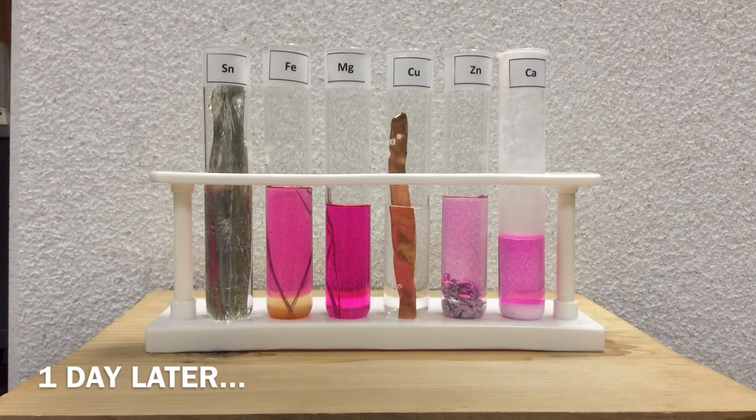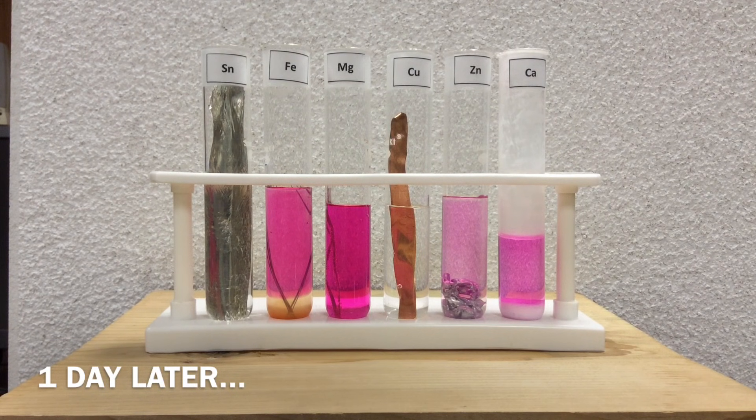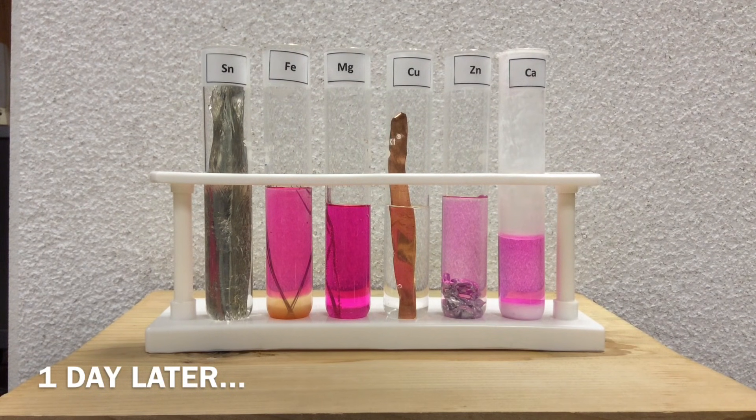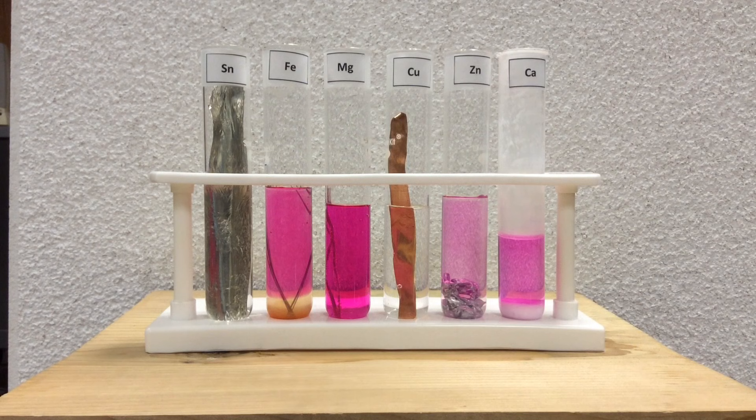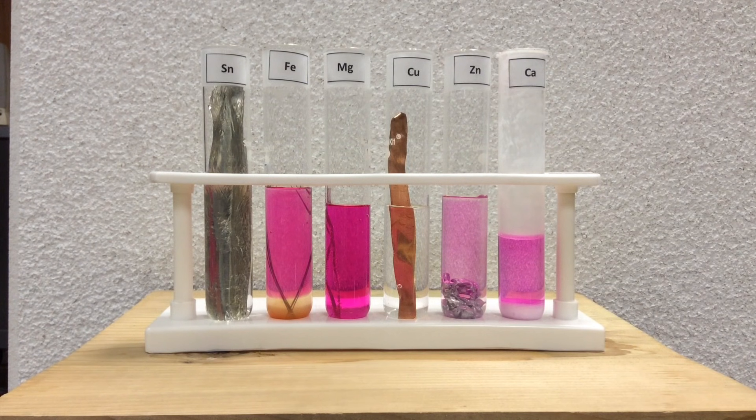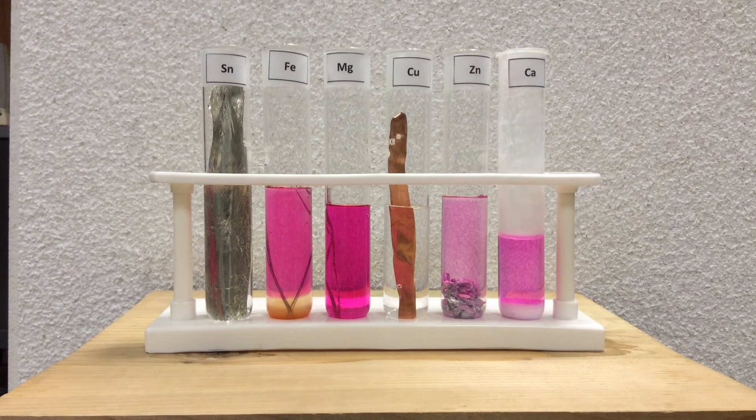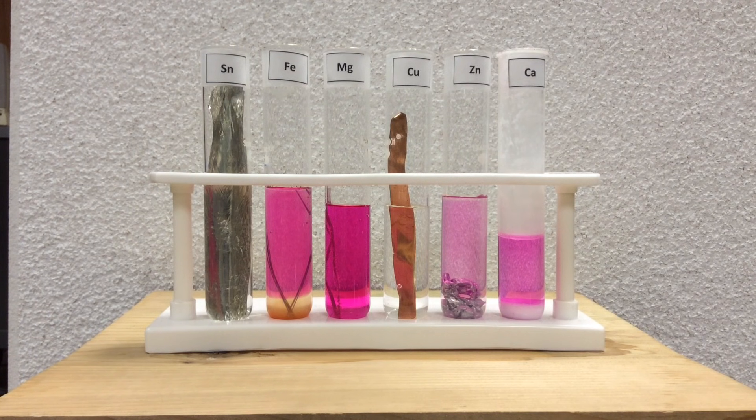So, a day later, one day later, okay, I couldn't help myself. In any case, you can see that clearly the iron, magnesium, and zinc showed some increased color in the red spectrum there because they created some base. Notice magnesium, okay, is the darkest.